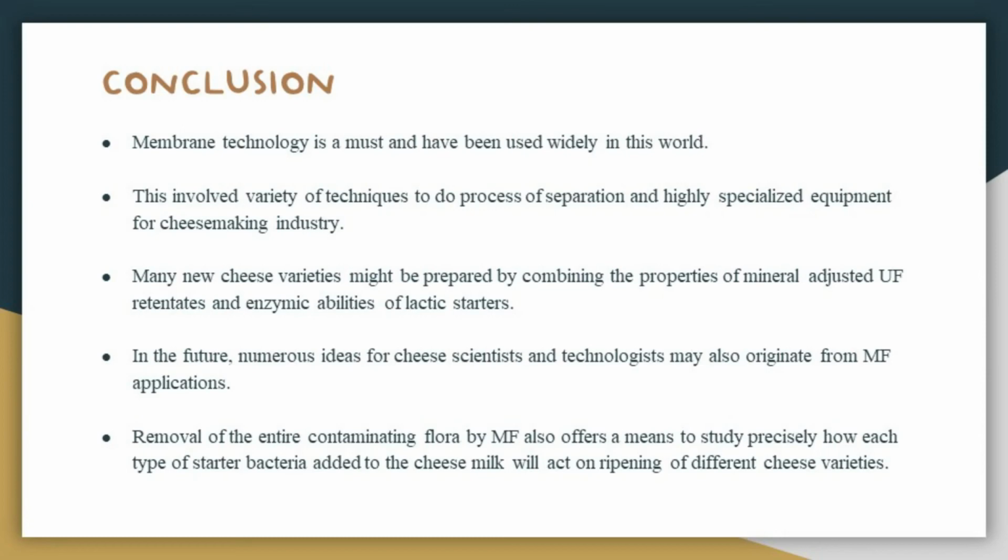Last but not least, removal of the entire contaminating flora by microfiltration also offers a means to study precisely how much of each type of starter bacteria added to the cheese milk will act on the ripening of different cheese varieties.